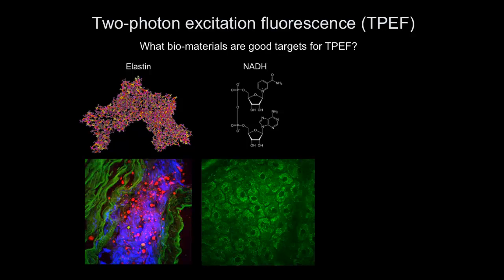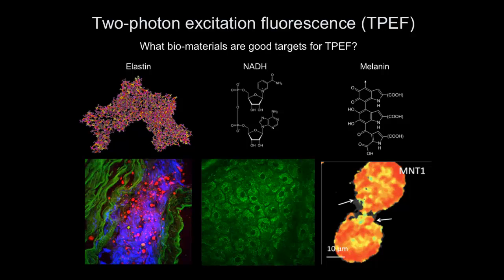That is actually an image from a live patient, the skin of a live patient. Melanin, interestingly, the molecule that gives you your beautiful color, absorbs a lot but doesn't fluoresce a lot. Okay, that's good, because if it did, we would all be glowing all the time. We do not. That means if you excite melanin with 1 photon, you really don't see much fluorescence. However, if you excite melanin with 2 photons, you do see a significant fluorescence coming up. That indicates we actually excite a different level in melanin than with 1 photon, and so it is able to fluoresce now.